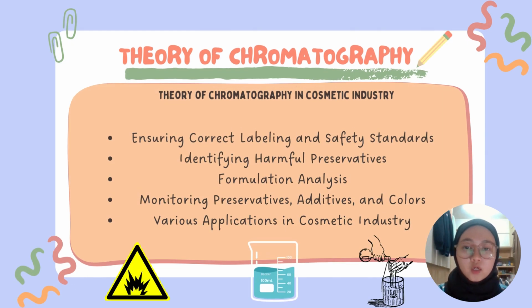So for the theory of chromatography, our focus is on the cosmetic industry. Thin layer chromatography helps us make sure cosmetic products are labeled correctly and meet all the safety standards of the cosmetic industry by identifying and separating the different color components that are used in these formulations, like pigments, dyes, and more. By looking at the different color components, you can make sure the product maintains consistent quality and formulation in every product. Thin layer chromatography helps you in identifying preservatives in the cosmetic industry, like parabens and others, in your cosmetic products that may cause harm to the skin and health.